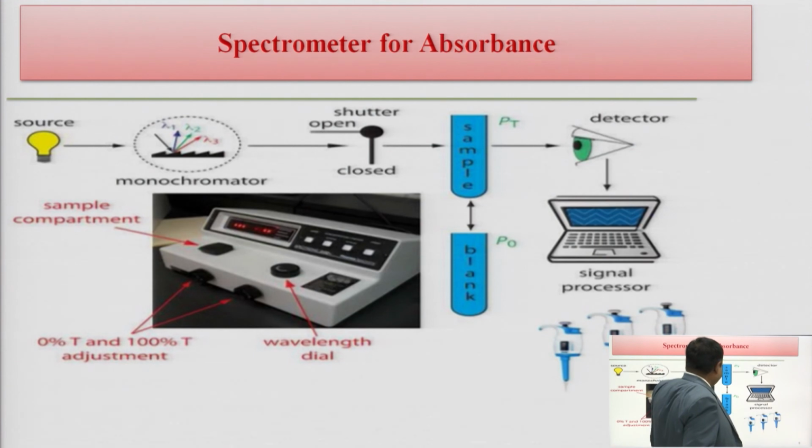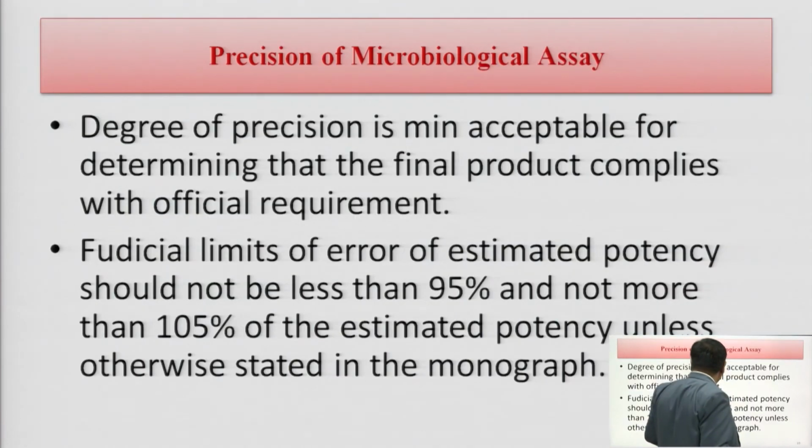This is the spectrophotometer which we used for our study, for our determination of absorbance. Initially adjust the value with the help of a blank and then determine one by one the absorbance of S1 to S5 and finally the absorbance for the unknown solutions.